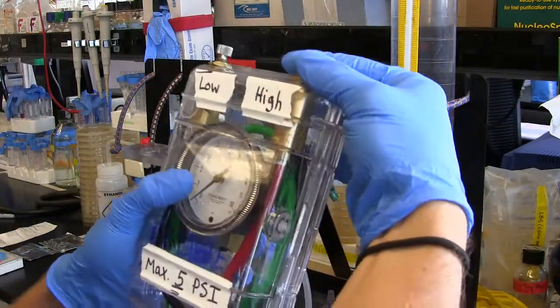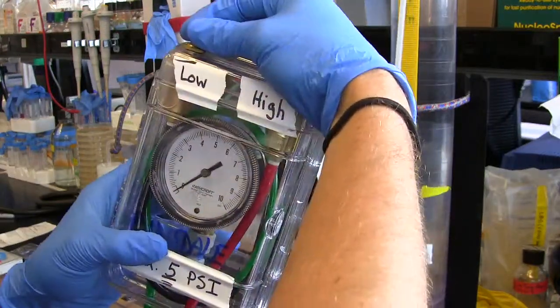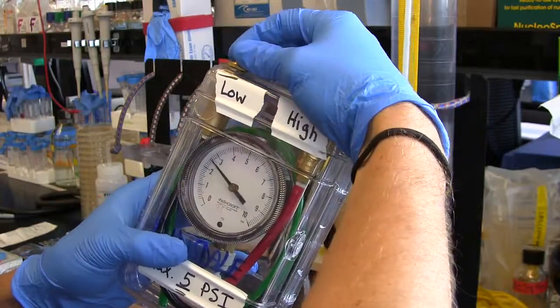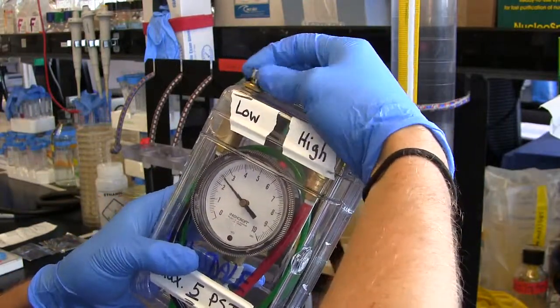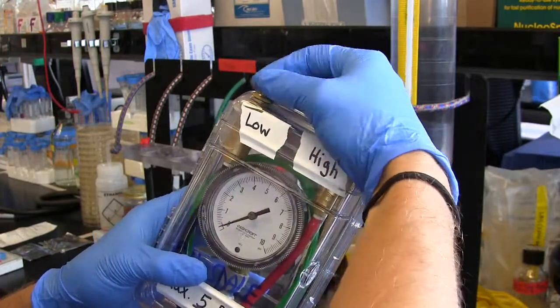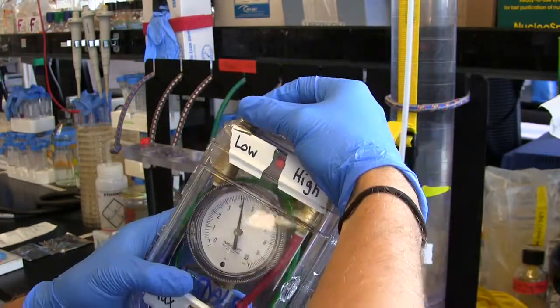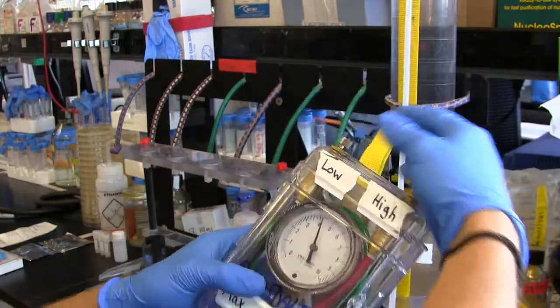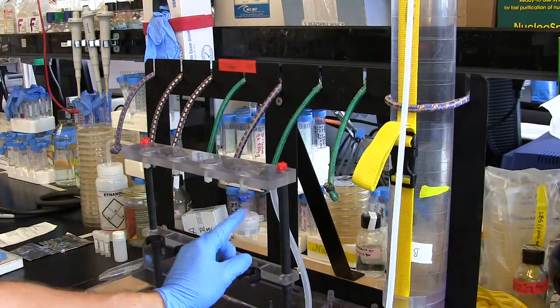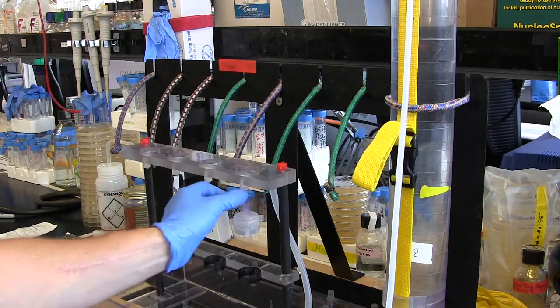Tighten down the high pressure fitting and watch out — it comes in pretty strong once you start getting pressure. See how quickly it comes up? Let's stay below five — stay on four right now. So now we have pressure going through the system, but I've got this spigot closed so no water is going to flow.